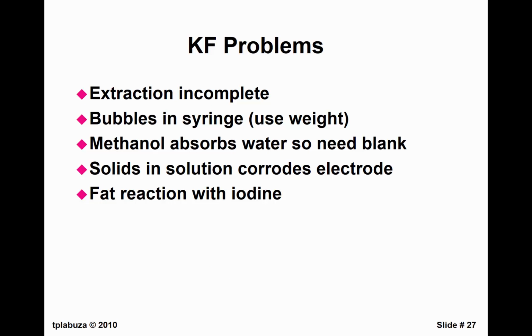Problems are that the extraction could be incomplete, or bubbles in the syringe, and that's why we weigh the syringe before and after. So you don't have to worry about flicking out bubbles or anything, because you just go by weight. The methanol itself absorbs water, so you need to do a blank and subtract that for the methanol that's in your measurement.